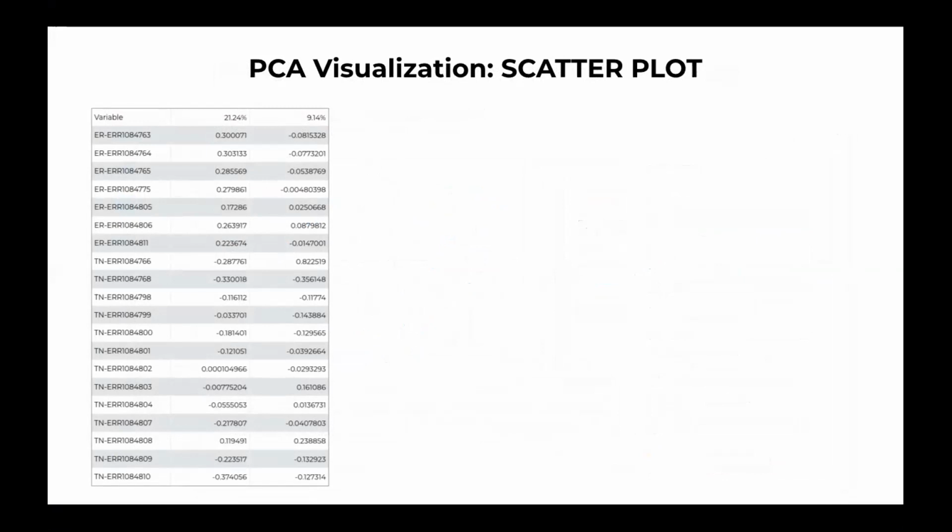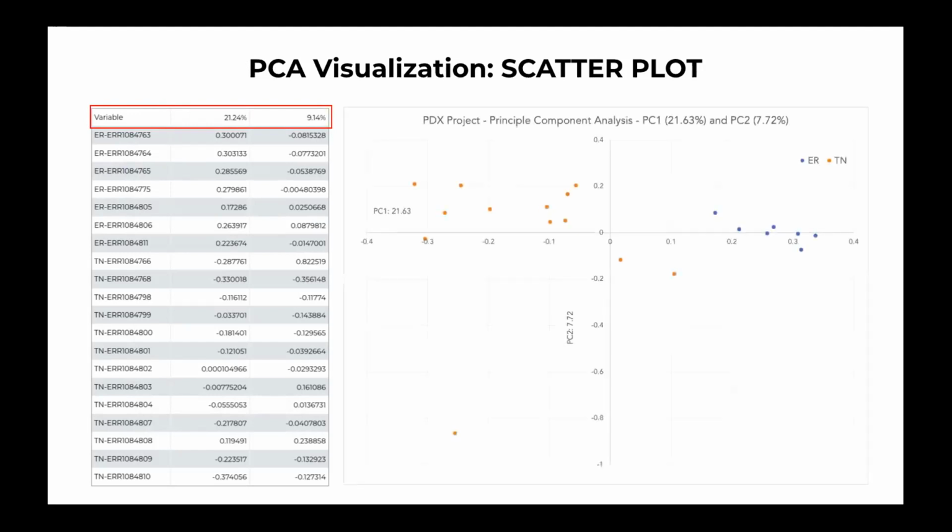Again, we will be describing more in our upcoming classes, but here, to understand, we have captured 21% and 9.14%, about 30% of the data, using the PCA. In the PCA, we get different PC1, PC2, and we can plot this and see how the data looks.